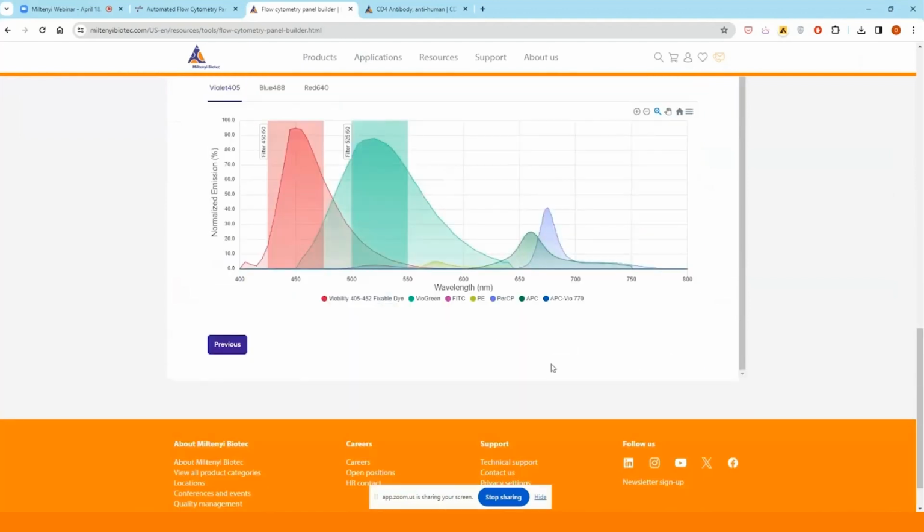Eventually, you may get some gating strategy figures shown in the bottom, showing you suggestions for gating strategy. These would be images copy pasted from open source sources like some publications or references available online that would be helpful even for your data analysis.